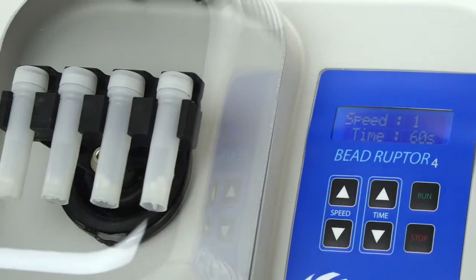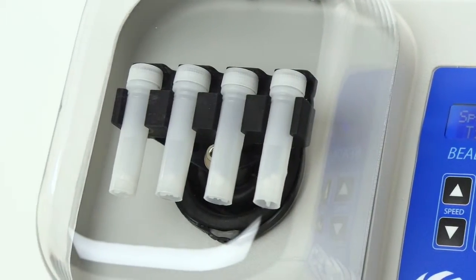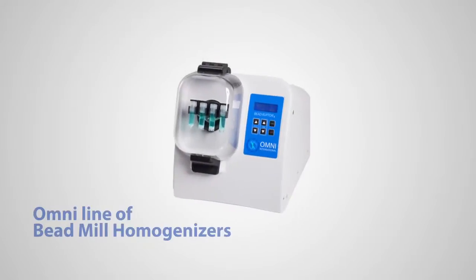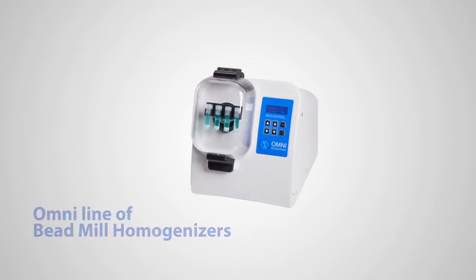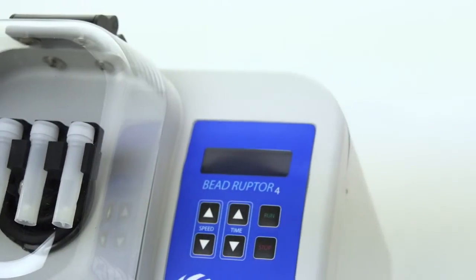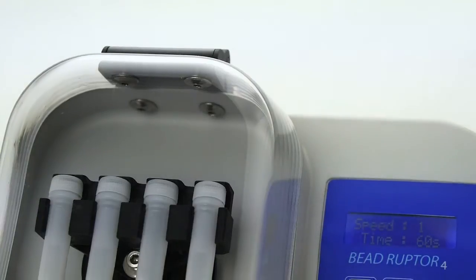The Omni BeadRuptor 4 is the newest addition to the Omni line of BeadRuptor bead mill homogenizers. Built upon the innovative design and unsurpassed quality of Omni's BeadRuptor family, the BeadRuptor 4 provides powerful performance in an extremely compact design.